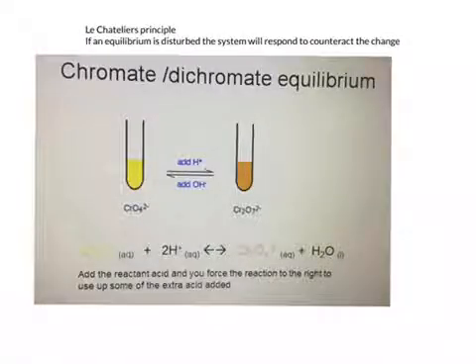Looking at the chromate-dichromate equilibrium with respect to Le Chatelier's principle. The chromate is the yellow form and the dichromate is the orange form, and they're related with this equilibrium equation.